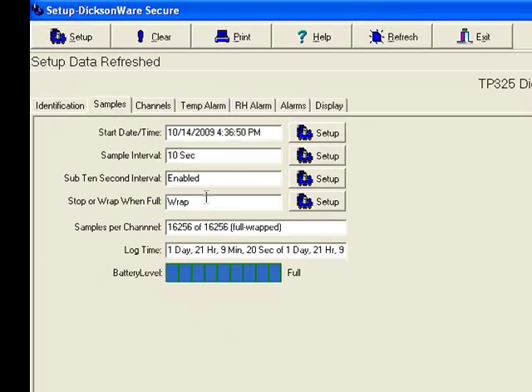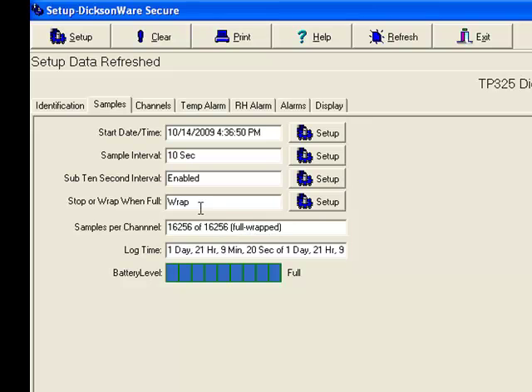It tells you how full it is, what it's doing. You can see ours is full, and it is just continuously wrapping around and replacing the original data.